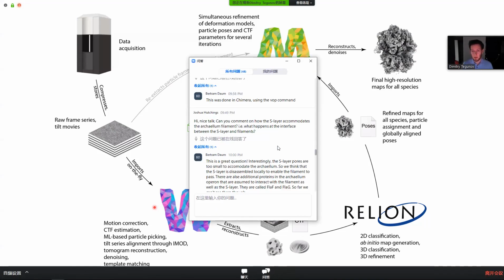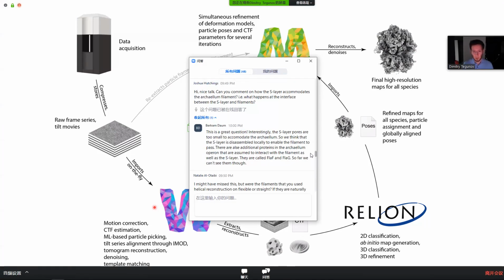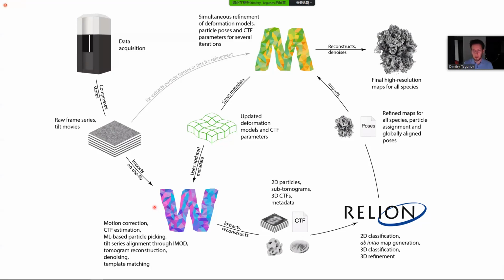Then it reconstructs the maps, and hopefully after one or several rounds in this accelerator ring, your particles fly out as really nice maps at high resolution.